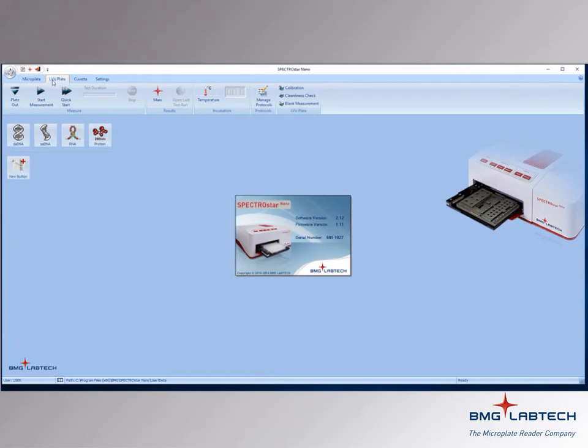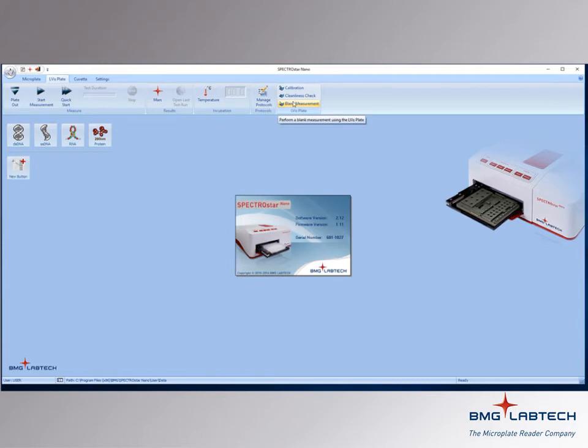Within the LVIS plate, a quite similar view is seen, but works with our low volume plate. Some functions specific to the LVIS plate are calibration, cleanliness check, and measuring of stored blanks.